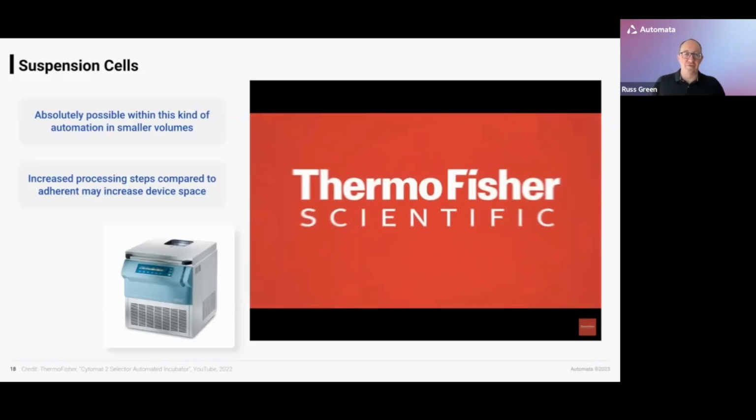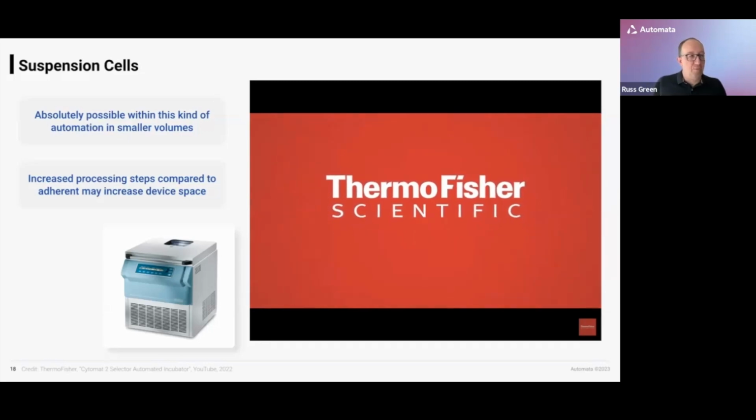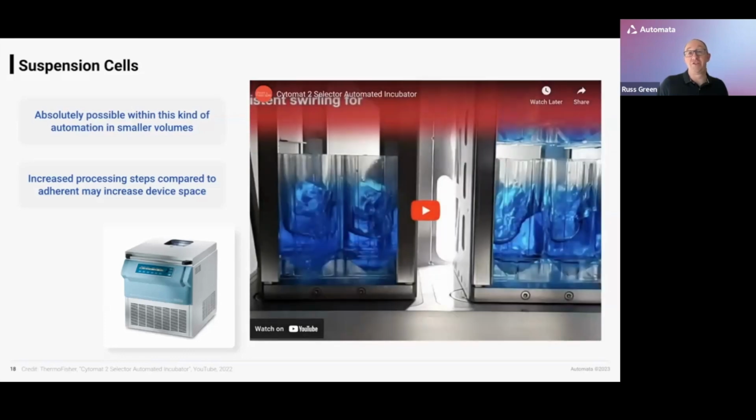So I include a picture of a centrifuge here because we may well have to pellet, almost certainly we have to have a centrifuge on these systems to pellet cells and allow us to do things like media exchange, splitting and cell counting. But those devices are available, especially when we switch into an SBS footprint labware-centric world.